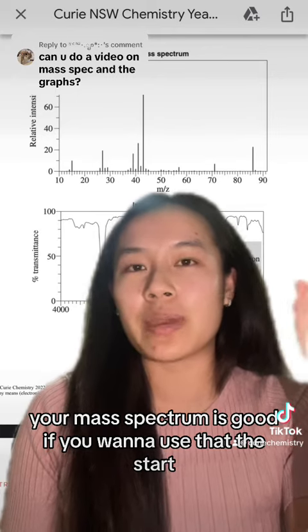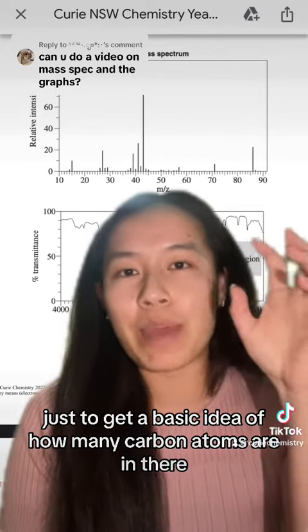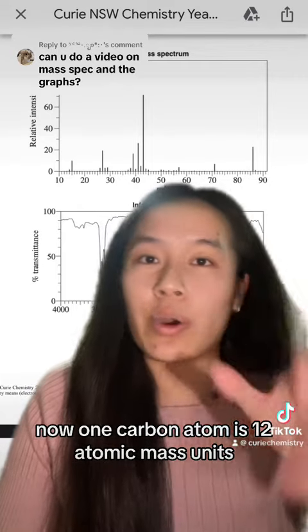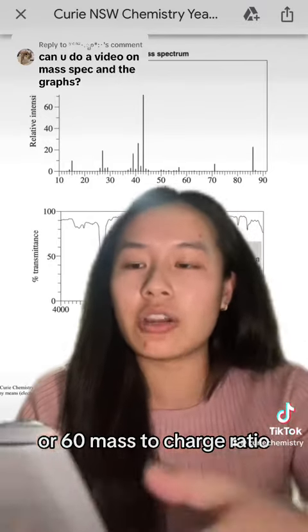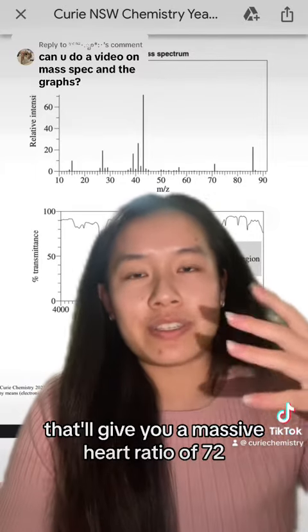We did say that your mass spectrum is best for checking your actual structure at the end. However, your mass spectrum is good if you want to use it at the start, just to get a basic idea of how many carbon atoms are in there. Now, one carbon atom is 12 atomic mass units, so if you do 12 by 5, you get 60 atomic mass units or 60 mass to charge ratio. And then if you get 12 by 6, that'll give you a mass to charge ratio of 72.